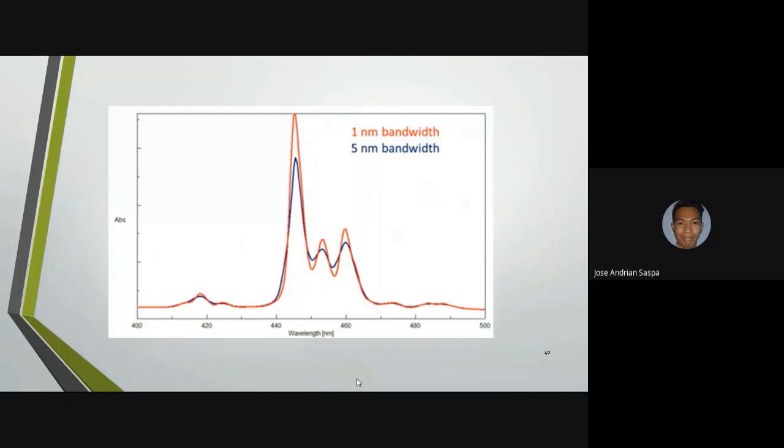Based on the picture, we are able to gather data in the form of an absorption spectrum. The data show how much light through a band of frequencies is able to pass through a sample to reach the detector. The peaks that we see show that not all light of that wavelength reaches the detector. It means that it is absorbed by the sample.